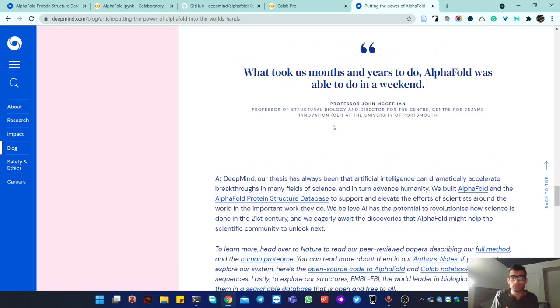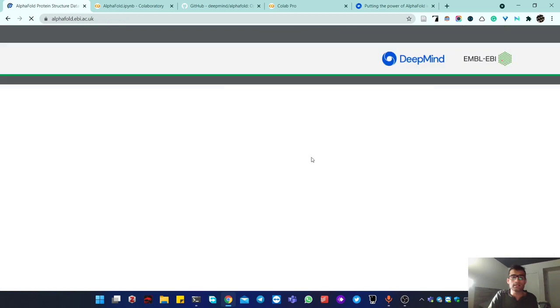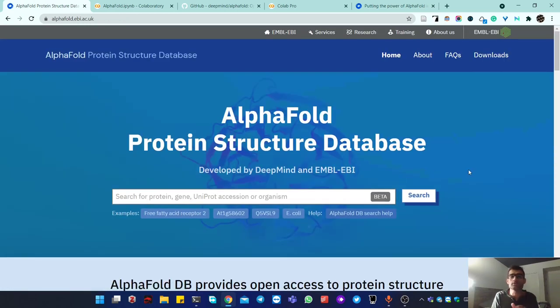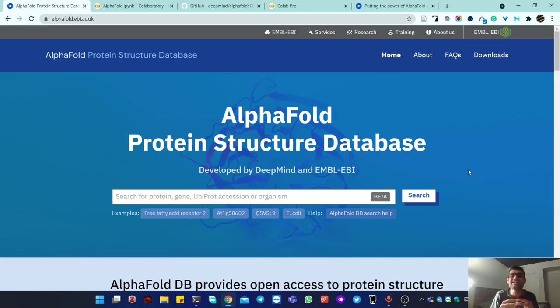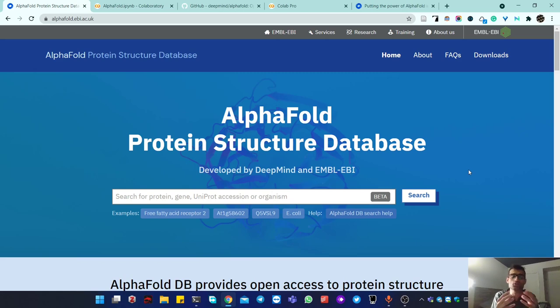If you're working with one of the 20 most commonly used organisms — like human, rat, or mouse — it's going to be easier for you, because Google made a partnership with the EBI (EMBL lab) and created the AlphaFold Protein Structure Database. It's essentially equivalent to UniProt, and it also has access to UniProt. They made their own protein data bank where you can search protein structures based on AlphaFold's predictions.